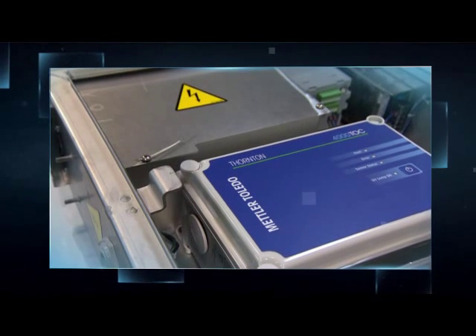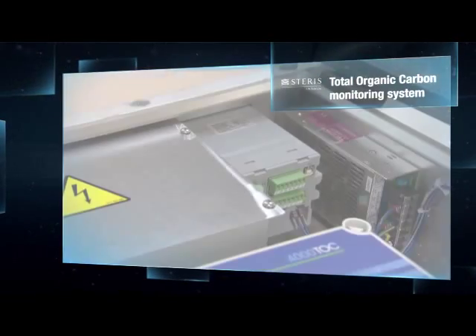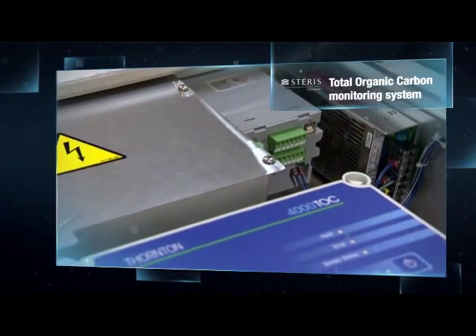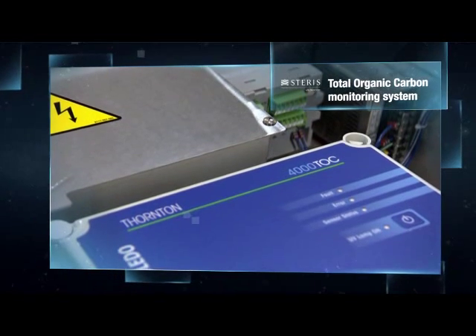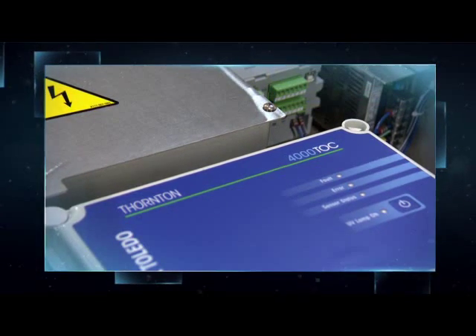For example, the Total Organic Carbon or TOC monitoring system detects the presence of residual detergents or soil in the final rinse water, which provides a higher level of assurance that the load items have been properly cleaned and rinsed.